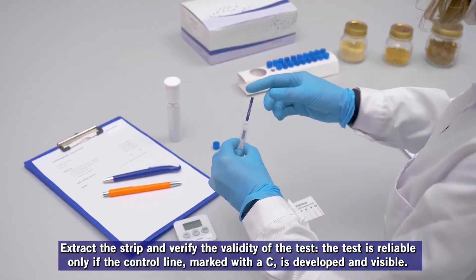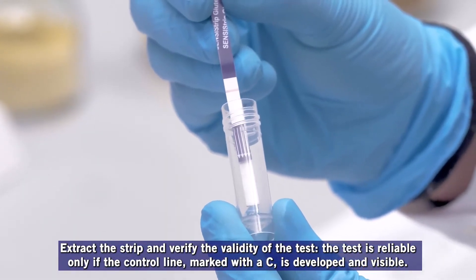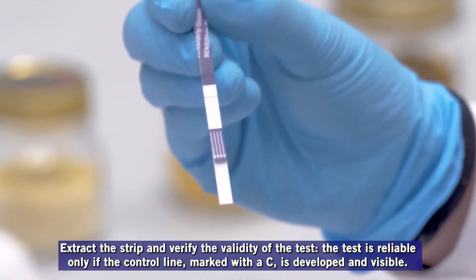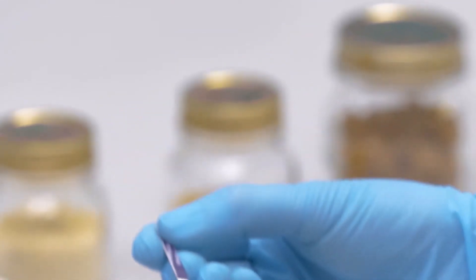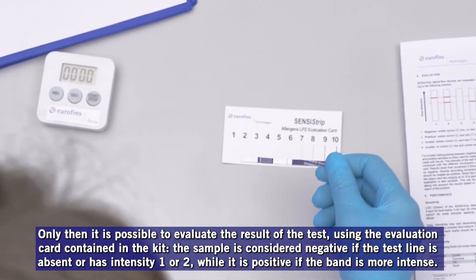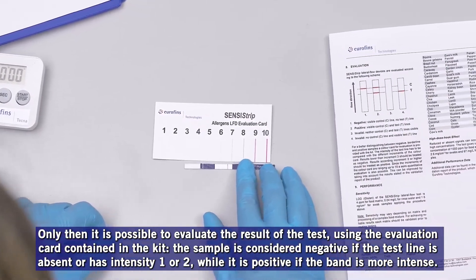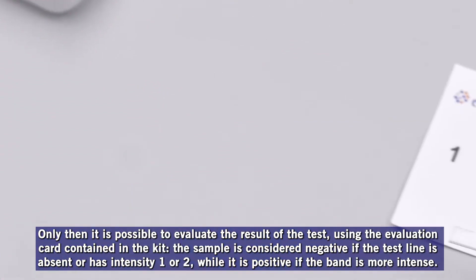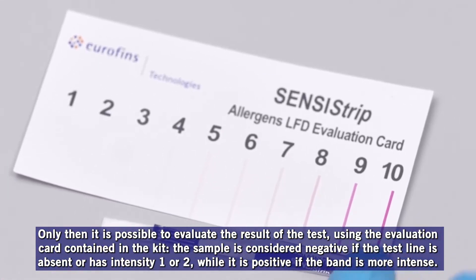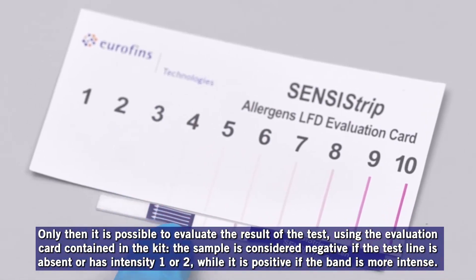Extract the strip and verify the validity of the test. The test is reliable only if the control line, marked with a C, is developed and visible. Only then it is possible to evaluate the result. Using the evaluation card contained in the kit, the sample is considered negative if the test line is absent or has intensity 1 or 2, while it is positive if the band is more intense.